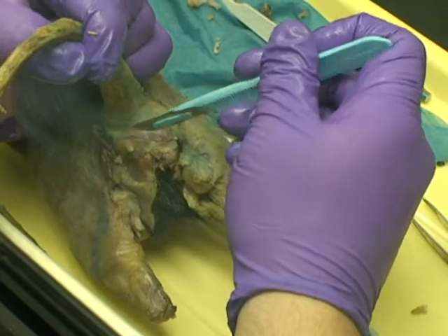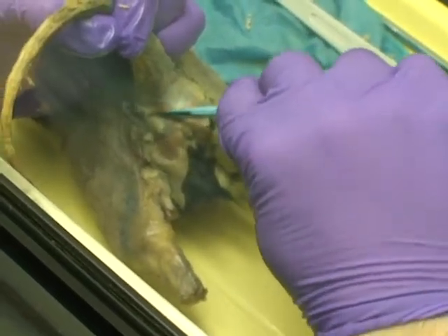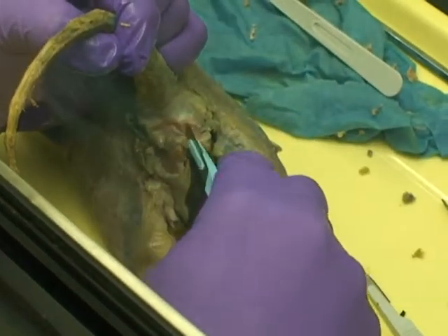Cut around the tissue, or around the actual anal gland as much as possible. Try to cut around with the fat. When you pop it, it'll look like you cut open a little sack, so you'll have an idea.